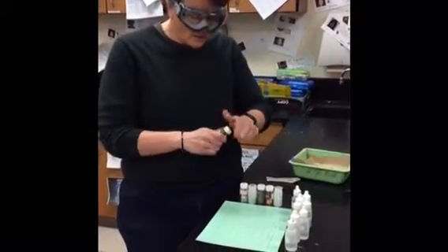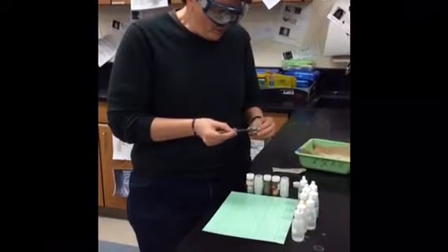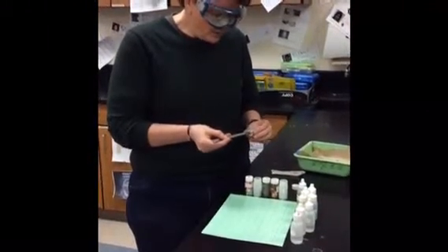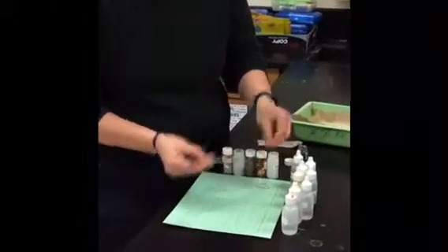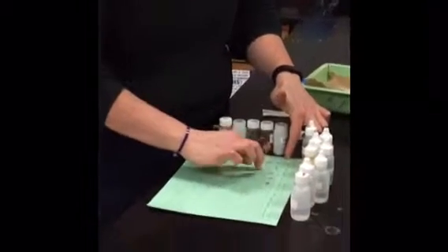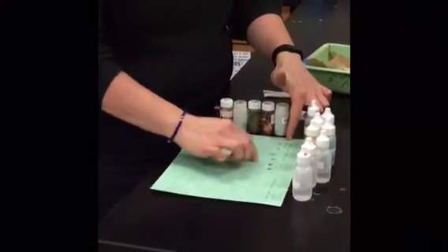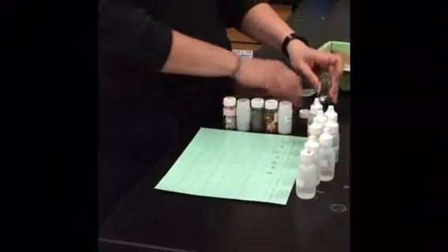Starting with the solids, you're going to take one piece of the solid and put it in each of the boxes. None of the solids are going to hurt you, so if you need to touch them with your fingers, it's not a problem. You're going to put one piece of metal in each box going all the way across. The last box is for the number of reactions, so you don't need to put a metal in that box.